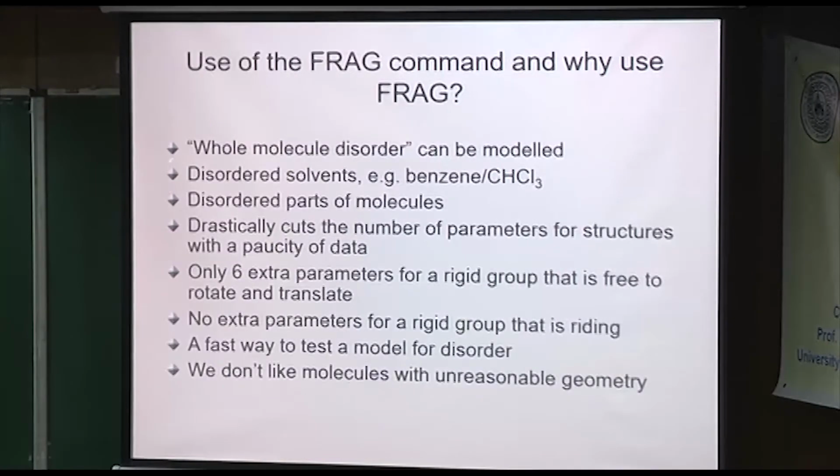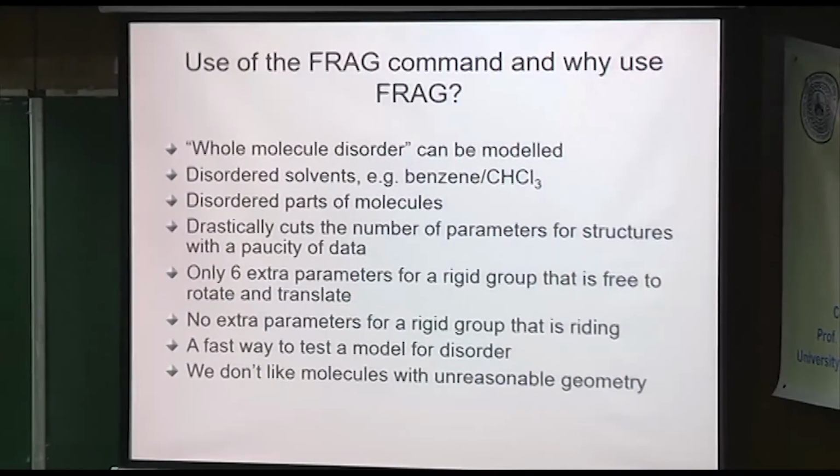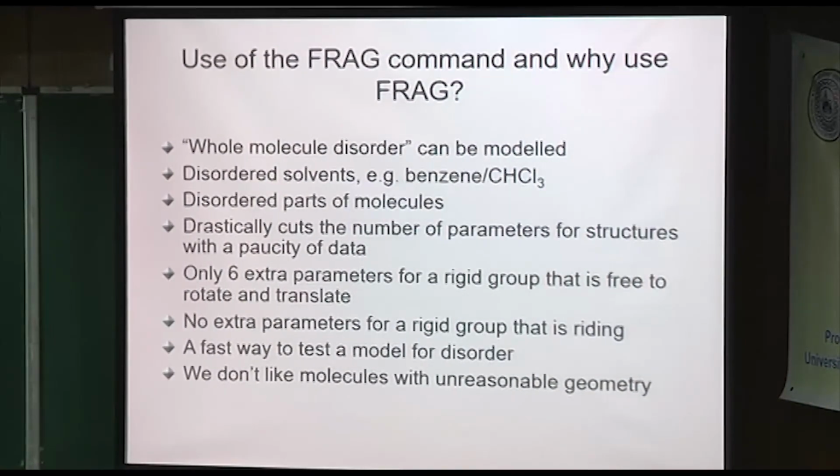But you can also use it for disordered solvents, disordered parts of molecules. It cuts down the number of parameters that you would need to use otherwise, because you're using a rigid group, and a rigid group basically only has 6 parameters to it: translation along the 3 directions and rotation around the 3 directions.